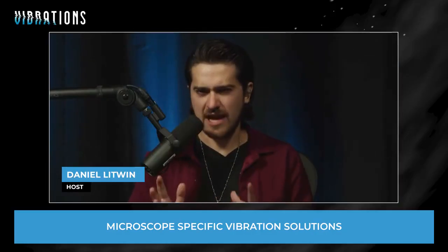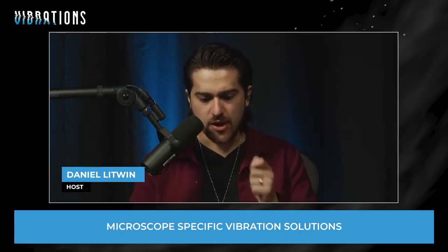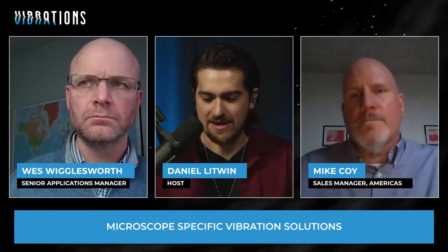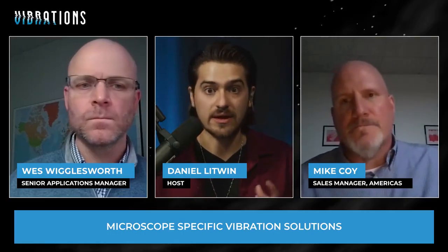Okay, so we've touched on this, but I just want to open up dialogue on it again. Vibration from both internal and external sources, right? Other machinery, other movement around a facility internally or externally, right? Traffic, public transit, construction, geography, weather. These things can significantly impact the performance of sensitive equipment like microscopes.